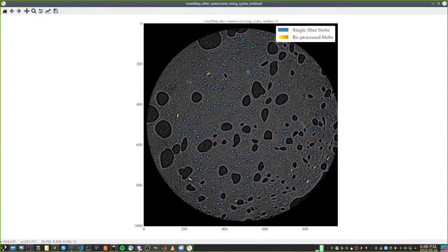So first it looks for all the connected regions. For each region it's going to give it a number, every single connected region by itself, not connected to each other. And then for those, it's going to check if they are convex.